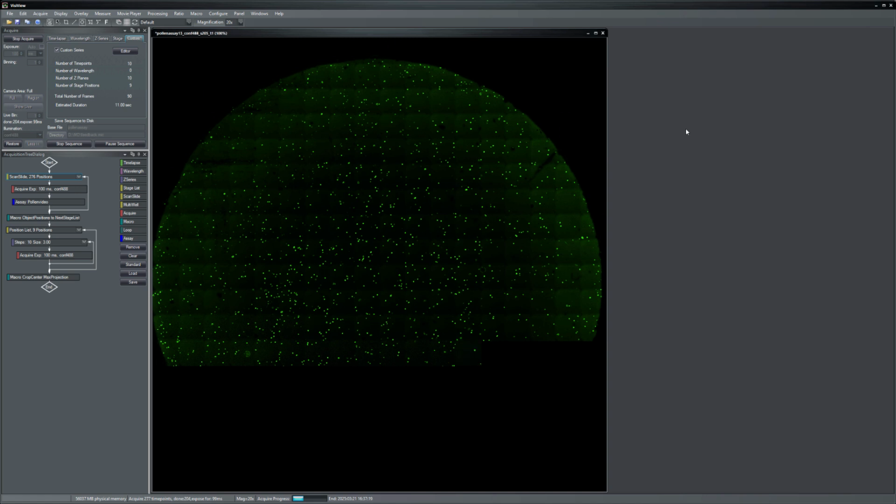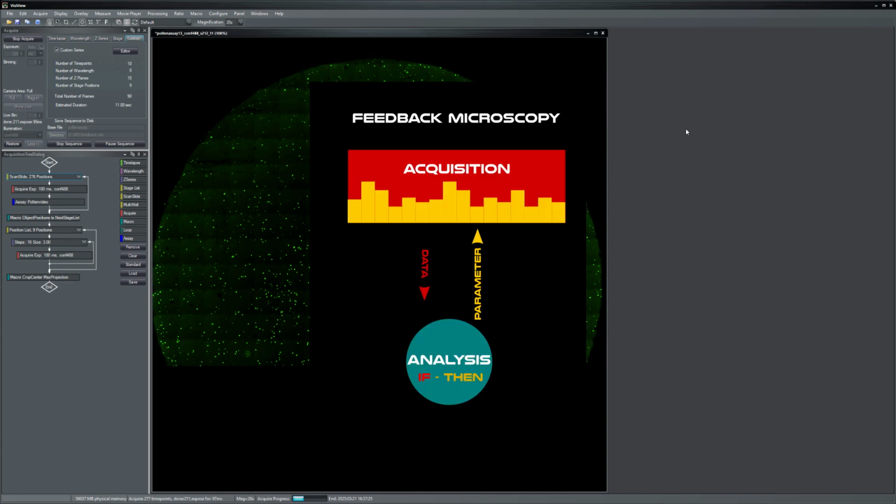We've seen how to launch a macro that runs during the experiment and how to analyze cells directly in a single workflow. Taking the idea of customization further, we inevitably ask about conditional imaging, also called smart imaging or feedback microscopy. This means that the imaging parameters are changed at runtime based on certain conditions.